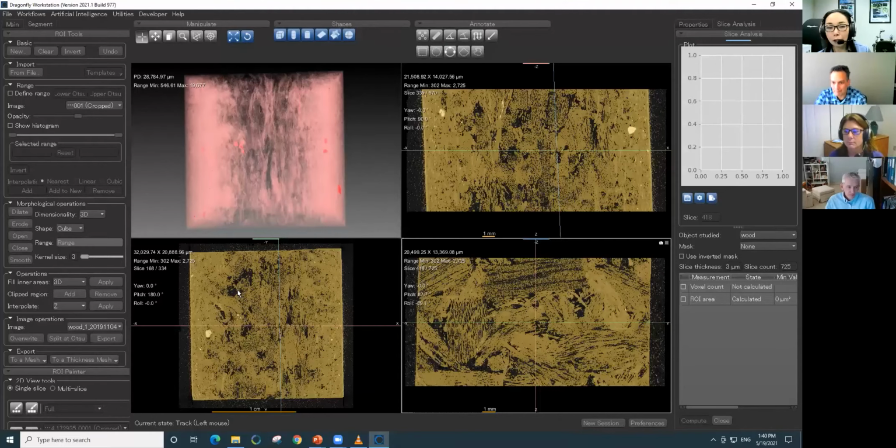So, not many good reasons not to use machine learning. But one of them is that machine learning is not perfect. You will see sometimes cases where even machine learning cannot do segmentation very well. And that's when I would switch to deep learning, which can do a lot more sophisticated segmentation. So that's one.